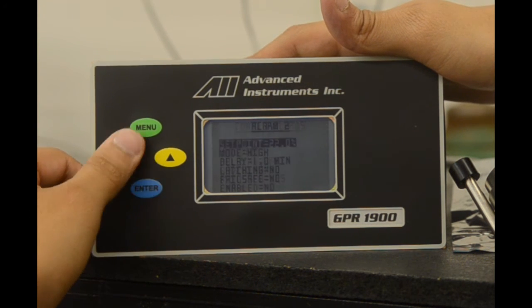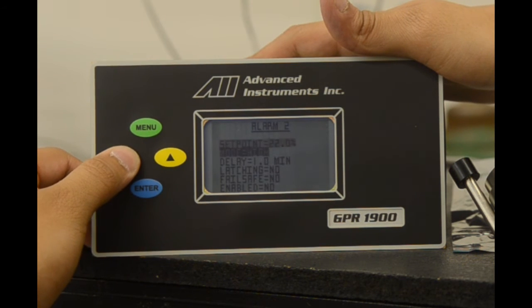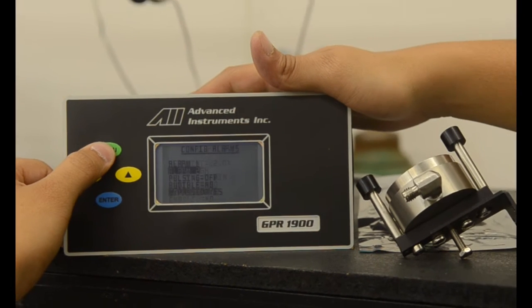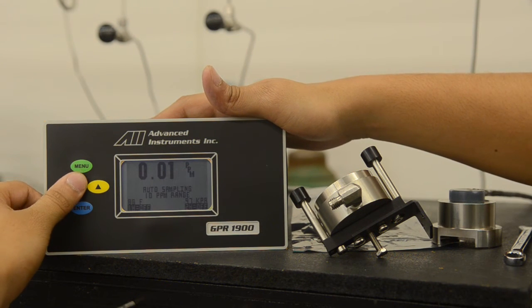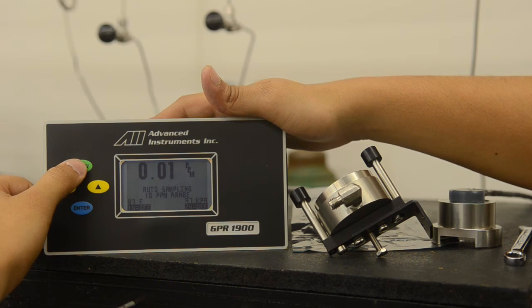We can configure alarm two in the same manner with the set point, mode, delay, latching, failsafe, and enabled options. We'll go back to the main menu and you can see the alarm values are set at the bottom of the screen.